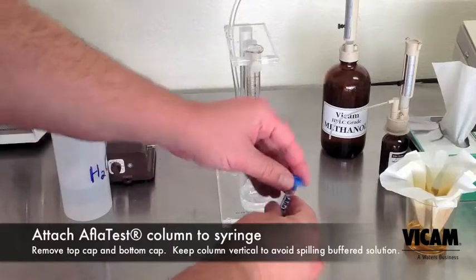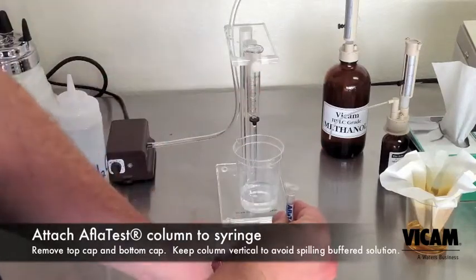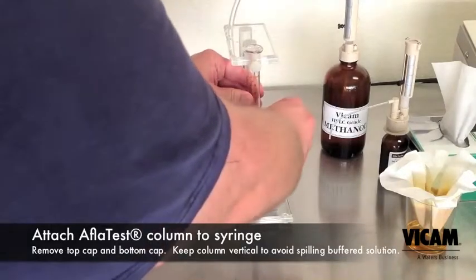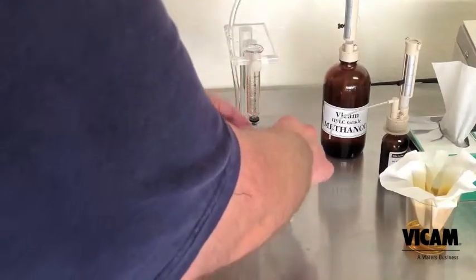Attach the AflaTest column to the syringe. The syringe coupler is simply a column cap with the bottom snipped off with a pair of scissors. If you lose the coupler, just make a new one.